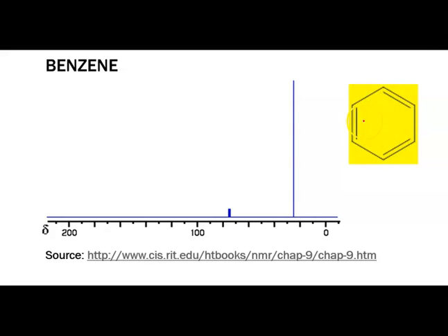So that resonates, it goes back and forth. Because of those, this peak here isn't closer to 0 like you might expect for a carbon with hydrogens all around it. That double bond does have an effect on its magnetic field, and so that's why it's a little bit further to the left. And again, here's that peak at 77.